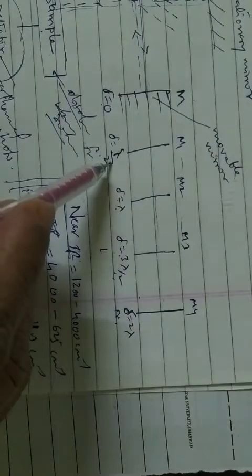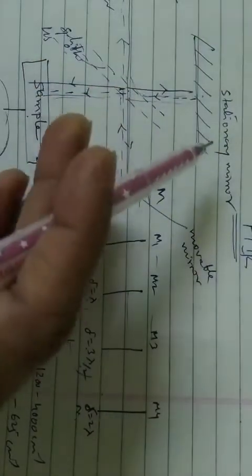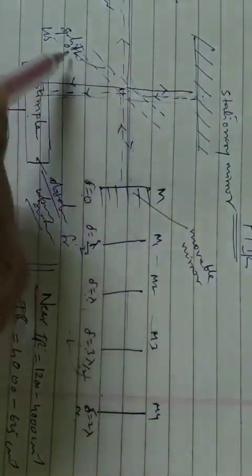Okay, now if you see the instrumentation here, how is this helping us? These different angles, integers and non-integers, are useful for deriving the very complicated form of the interferogram. Whatever radiation is deflected from this beam splitter, as I said, undeflected and deflected, is positioned at an angle of 45 degree.